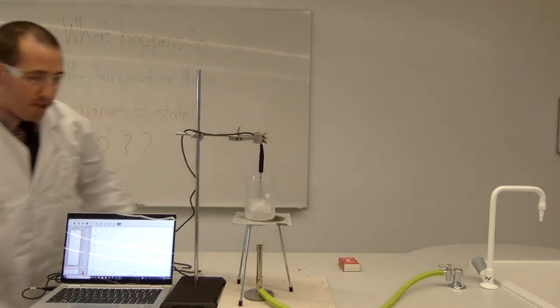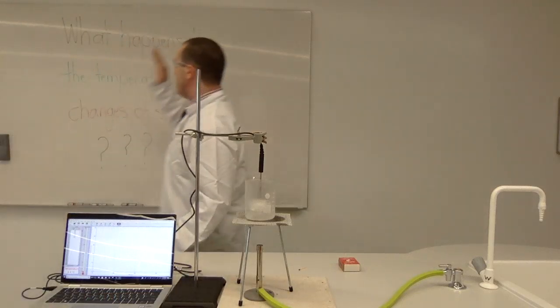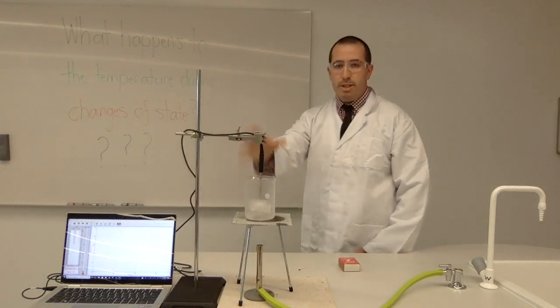Welcome to another exciting episode of Science. What we have here is our experiment looking at what happens to the temperature during changes of state.